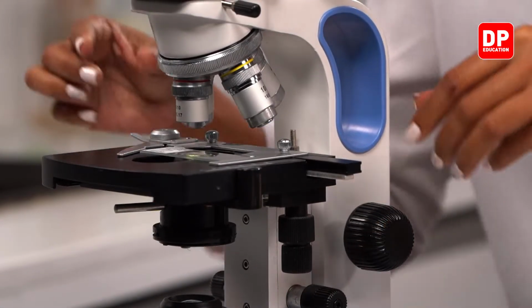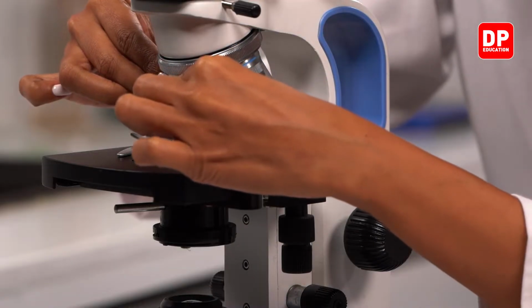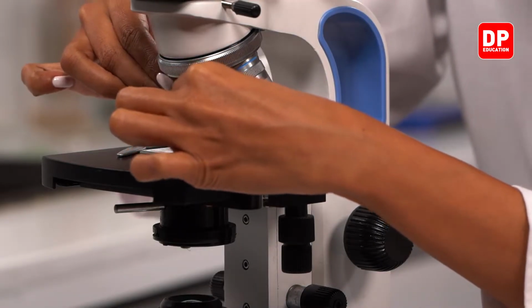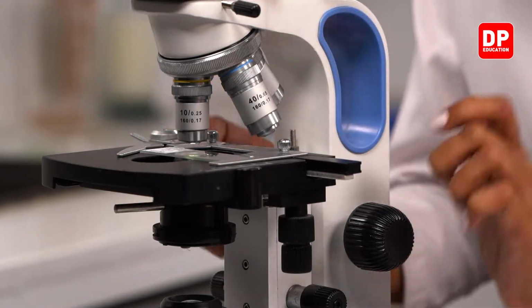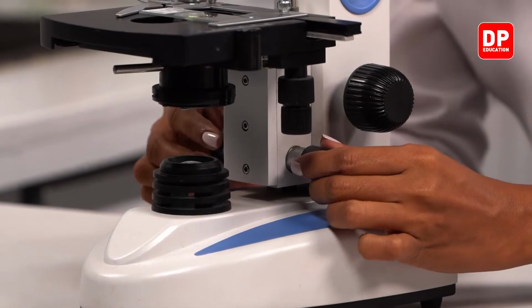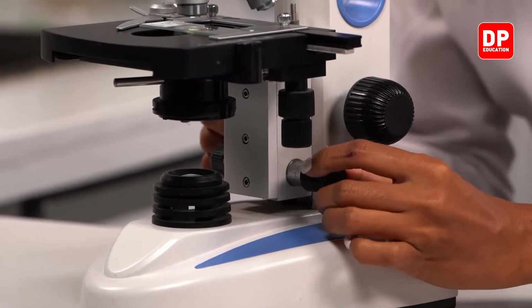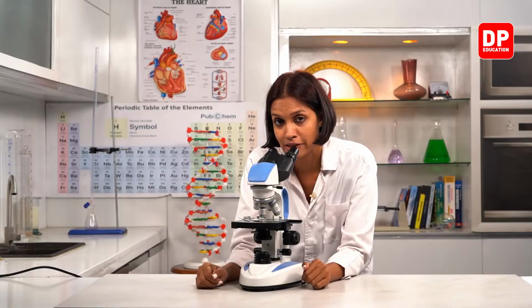Then we can change the objective lens by rotating this nose piece, right? So we have to be very careful when we do this, not to damage the lens, right? And then while looking at this, with the fine adjustment knob, we can get a clear image of a particular part of the slide.